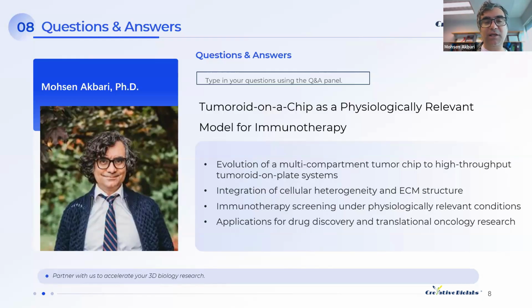However, there is always an effect of the tissue culture on the heterogeneity that you typically observe. So we look at the endpoints eventually, and then we test drugs, and for validation, compare those results with clinical data. Again, this is collaborative work with clinicians for further validation. It needs a lot of back and forth validation between our model and clinical data. But that's definitely a valid point, and I think more work needs to be done to address this.